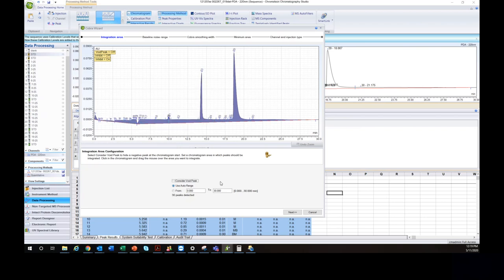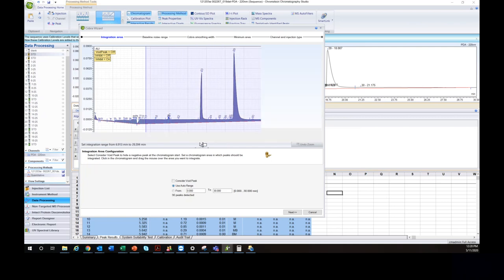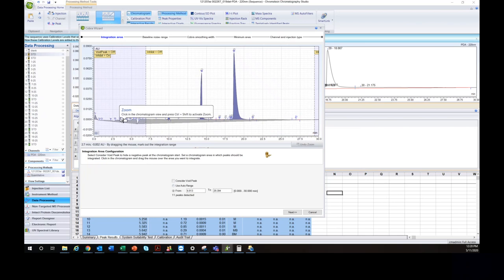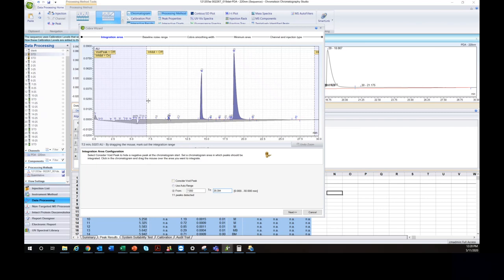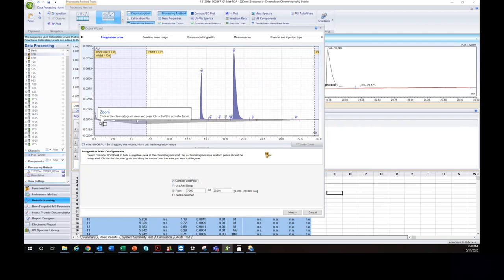In the Cobra wizard, there are five steps. The first: define the region you want to integrate. In the beginning of this chromatogram there's a lot of noise — void peaks and dips — so I'll left-click and drag to select only the region of interest starting around the 6.9 minute mark. You can also type in an exact time value. There's also a 'consider void peak' option which prevents integration of negative void peaks up front, though it may not work for peaks further out in the run.